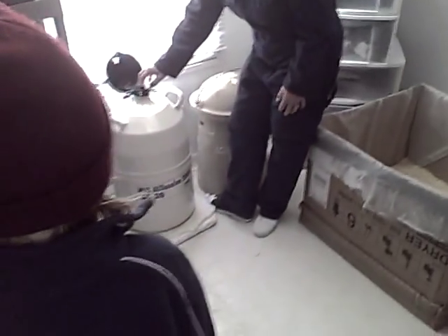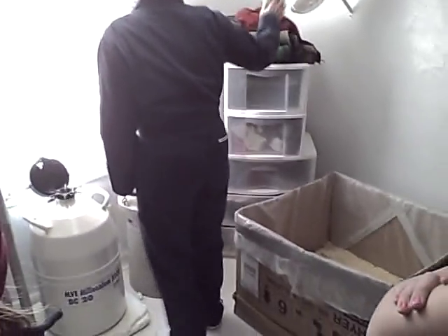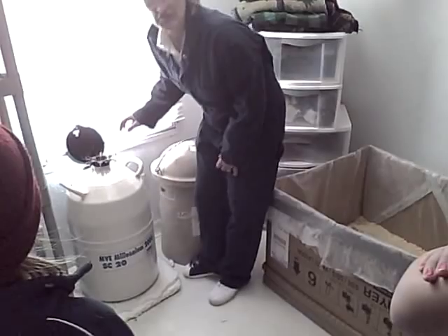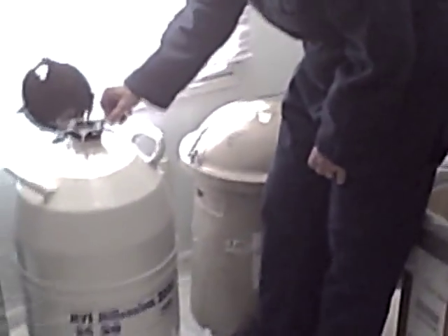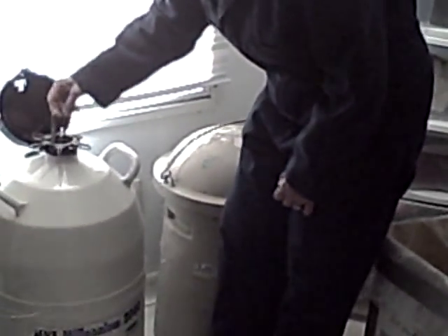This is a semen tank and this is where I keep all the semen. It is 320 degrees below zero in here. This is basically a thermos. It gets filled every three months with liquid nitrogen.